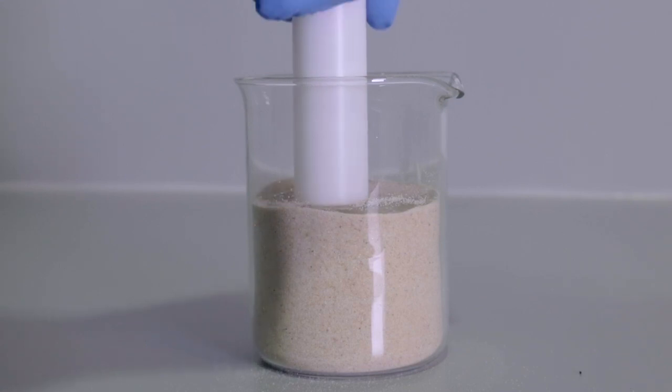A very important characteristic of powders to appreciate is the way they can behave differently depending on whether it's a confined or an unconfined stress environment. If you look at this ceramic we have in a confined beaker and we impose a stress on the top, very little flow occurs because it's a stiff system and it doesn't respond well to being forced in terms of its flow.